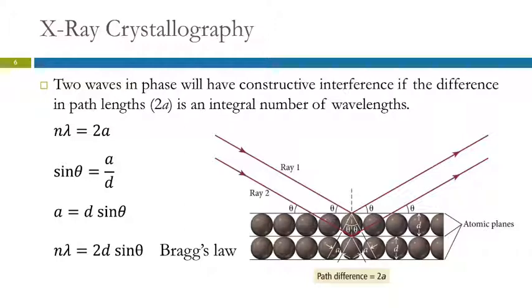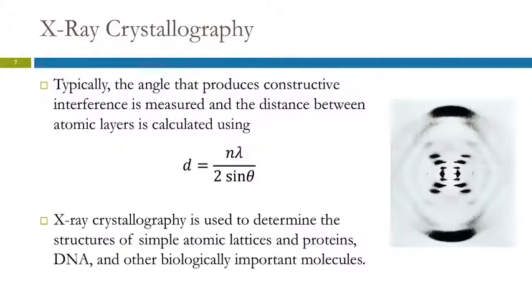And so by varying the angle at which the X-ray hits the solid and observing the diffraction pattern, you can find the distance between the particles. You can imagine there's a lot of math and geometry involved in that. It takes a bit of study to get much information out of something like this.